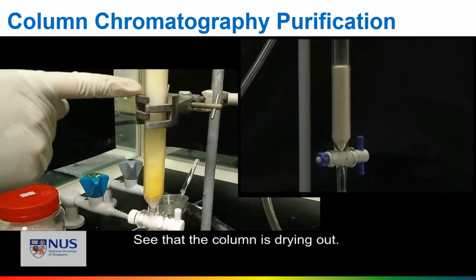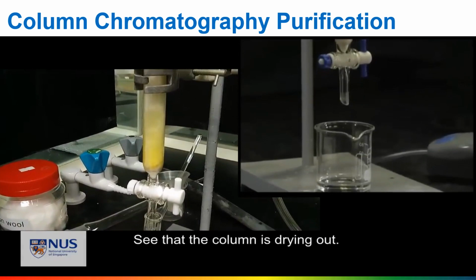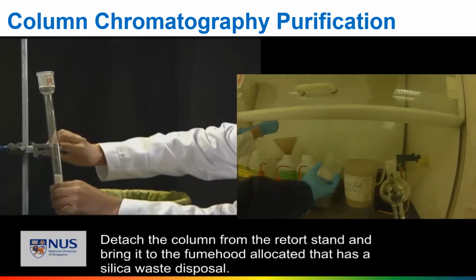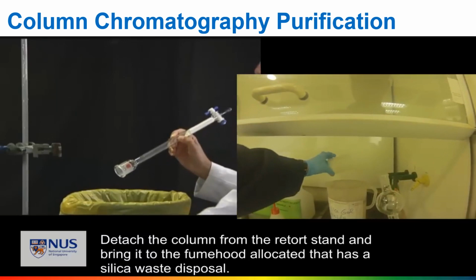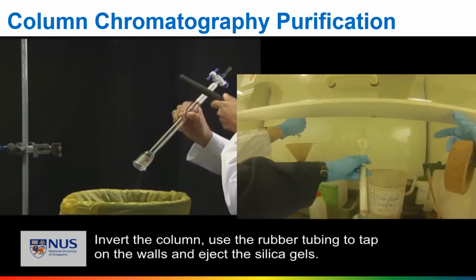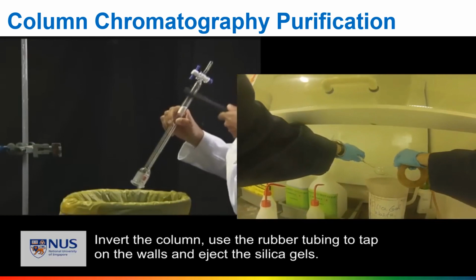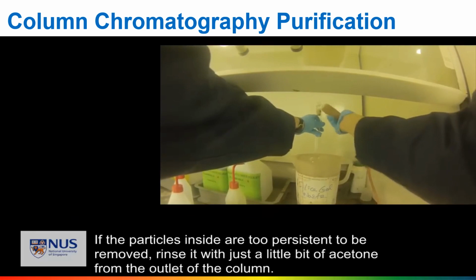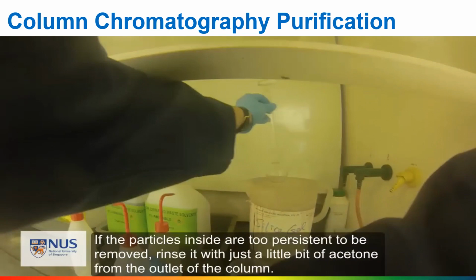You see that the column is drying out? That's good. Now, you're ready to clean the column. Detach the column from the retort stand and bring it to the fume hood allocated that has a silica waste disposal. Invert the column and use the rubber tubing to tap on the walls and to eject the silica gels. If the particles inside are too persistent and stubborn to be removed, rinse it with just a little bit of acetone from the outlet of the column. So voila!